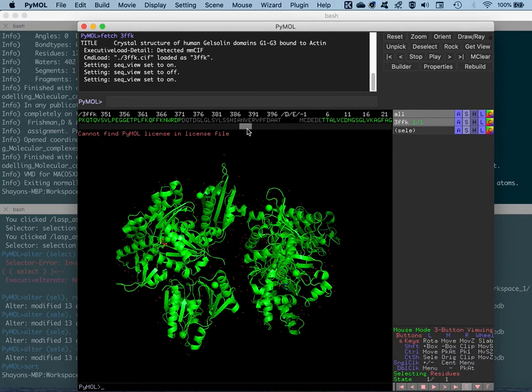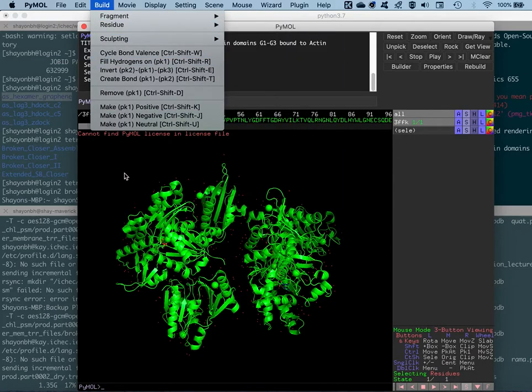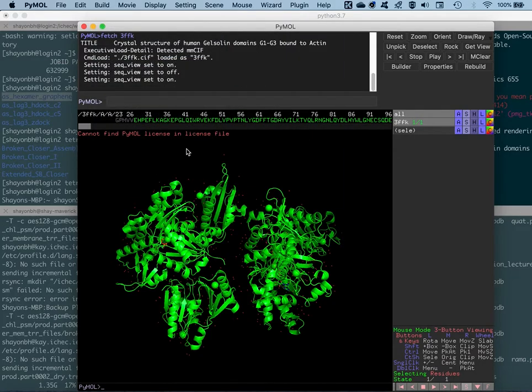This information is very useful because in the next tutorial, advanced characterization by X-ray methods, we'll be reconstructing these missing residues via an ab initio scheme by manually curating the missing regions using the build and sculpt tools available in PyMOL, and also by homology modeling, where we'll use available PDB structures with high sequence identity as templates to model these missing regions. So it's going to be a lot of fun.